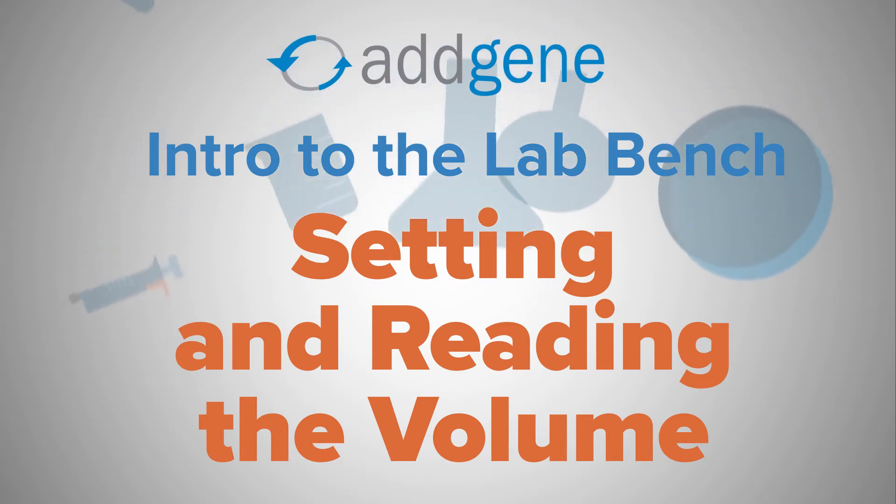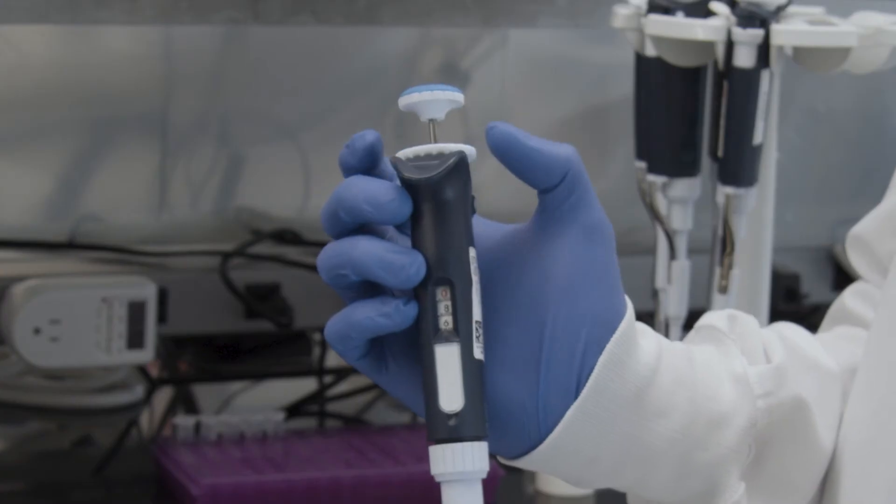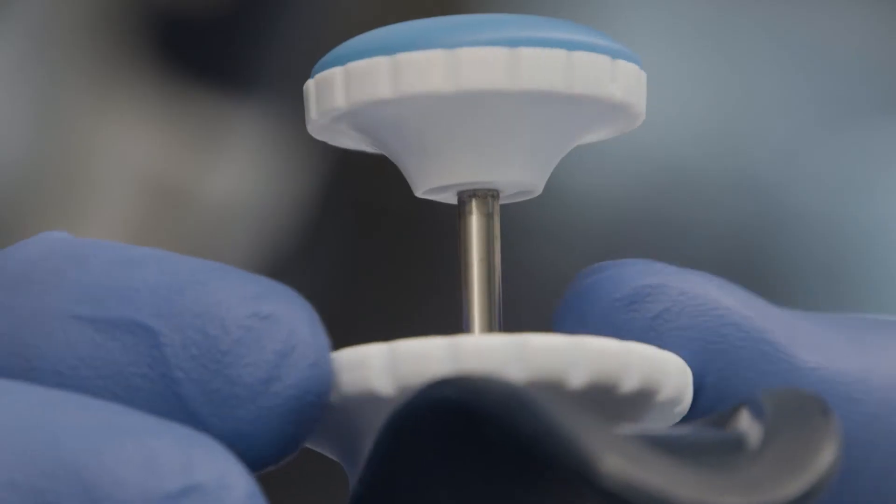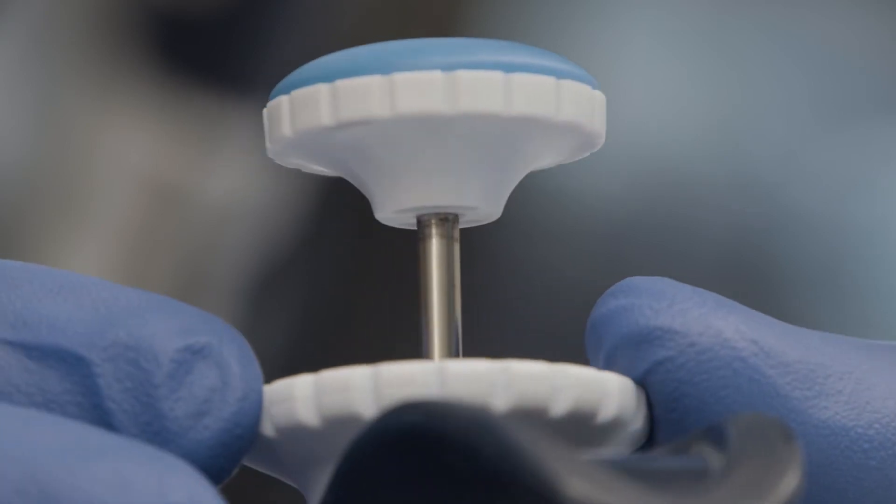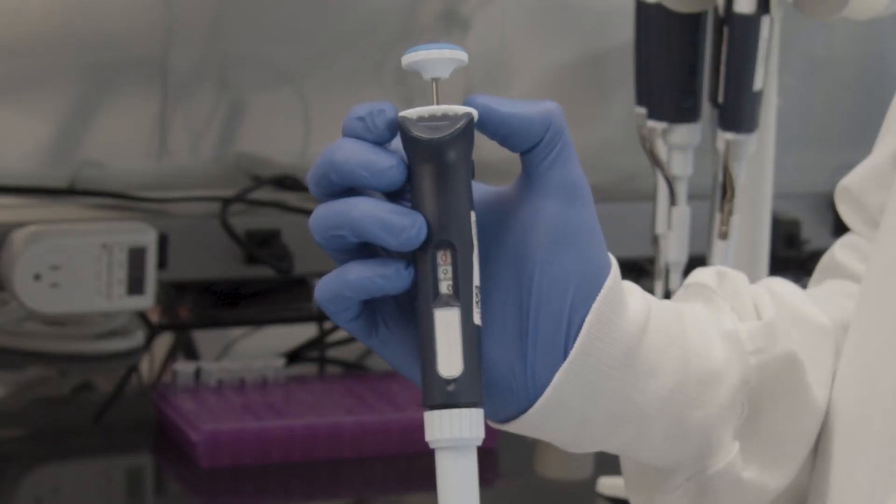Feeling more comfortable with the pipette? Great! Let's talk about setting and reading the volume on the pipette. Setting the volume is the same across all standard pipettes. Just rotate the ring below the plunger to increase or decrease the volume. But, reading the display is slightly different across different pipette sizes.